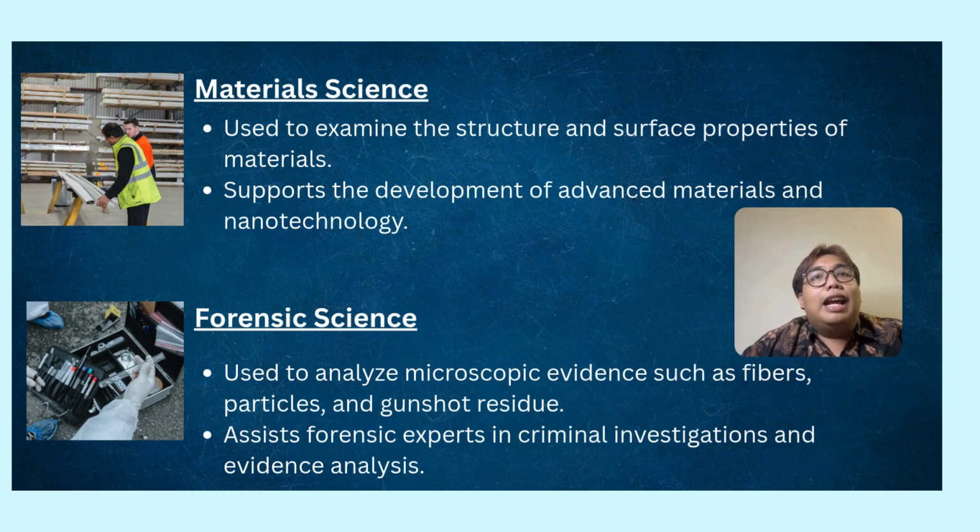Other than that, this technology is also used in material science. It helps researchers examine the structure and surface of different materials in a very detailed way. By doing this, scientists can understand the properties of materials better and use that knowledge to develop more advanced materials. It is also very important in the field of nanotechnology, where scientists work with extremely small structures and particles.